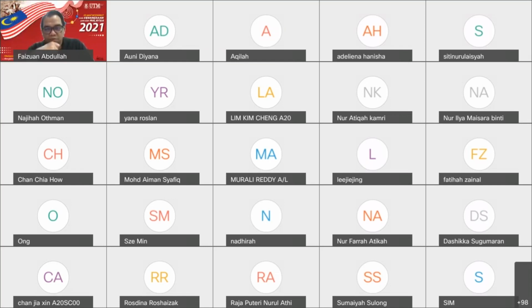But we have a modern instrument called atomic absorption spectroscopy, or the atomic absorption spectrophotometer. So the concept is quite easy.